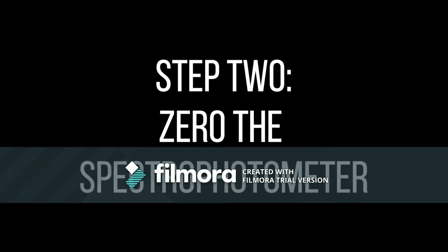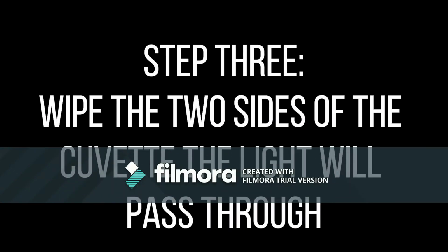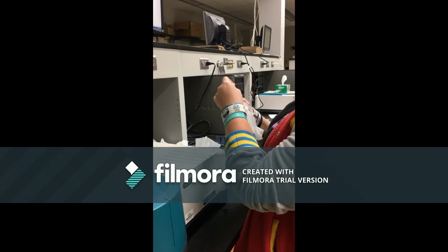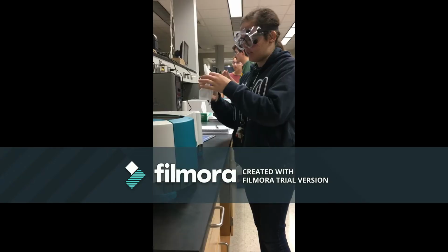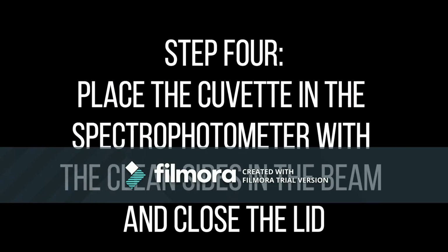Step 2. Zero the spectrophotometer. Step 3. Wipe the two sides of the cuvette the light will pass through. Step 4. Place the cuvette in the spectrophotometer with the clean sides in the beam and close the lid.